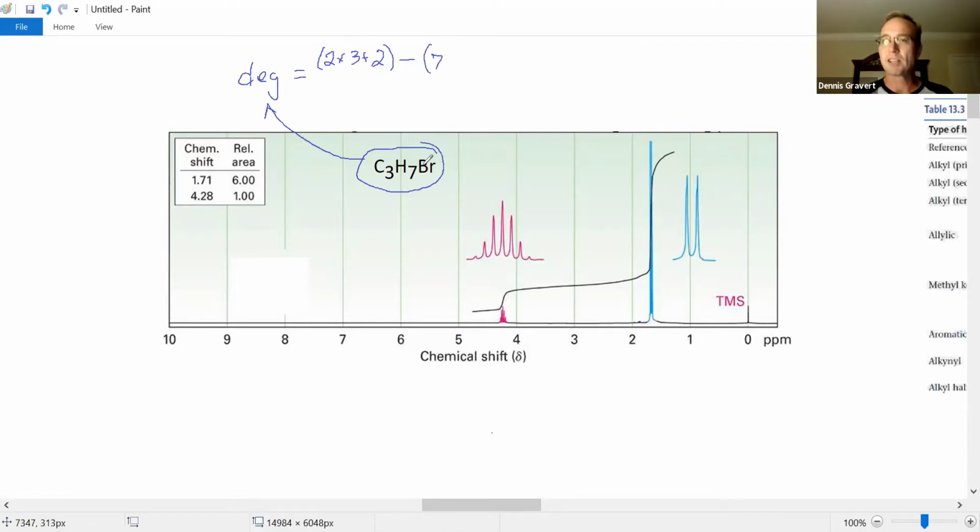And then how about adjustments for halides? Halides and hydrogen, we'll start with the letter H. Count halides like hydrogen. So I know I've got 7 actual hydrogens, but bromine, I'm going to count you as if you were a hydrogen. Oxygen looks like the number 0, so don't adjust for oxygen. Nitrogen is negative. Subtract 1 if the nitrogen shows up.